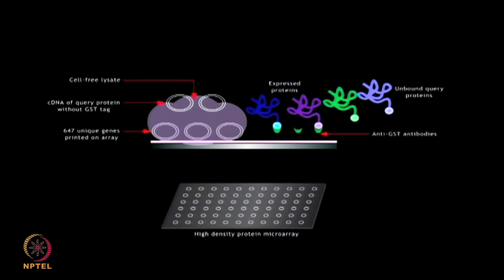After addition of the cell-free expression based system, proteins containing a GST tag were synthesized and bound onto the capture antibody.